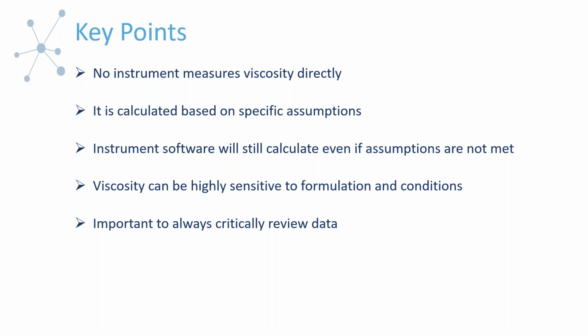What I hope people will do moving forward is, when you get your data, look at it and say, does this data make sense? Does it make sense based on, for example, the visual observations I have of the material, historical data that we have, or data in the literature? How does it jive with other analytical data that we might have on this type of sample? It's always a good idea to look at it and see, does it make sense?